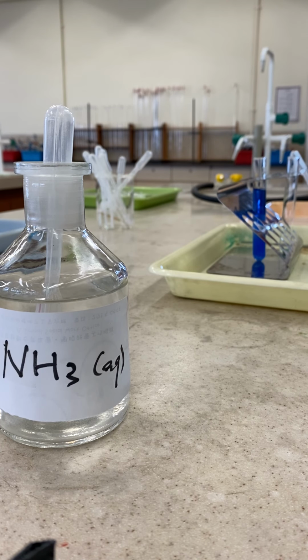In this case, there are new substances formed, and the chemical property of copper-2 sulfate is that it can react with ammonia, and on the contrary, ammonia can react with copper-2 sulfate. The reaction between them is one of the chemical properties, because when you're doing this, a new substance forms, or a chemical reaction is involved.